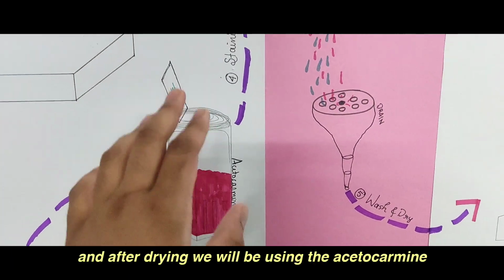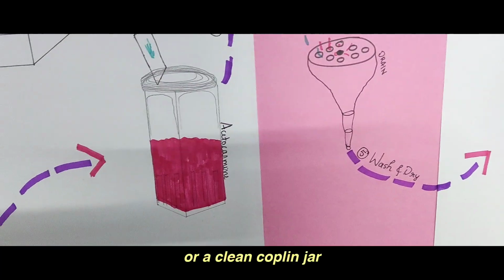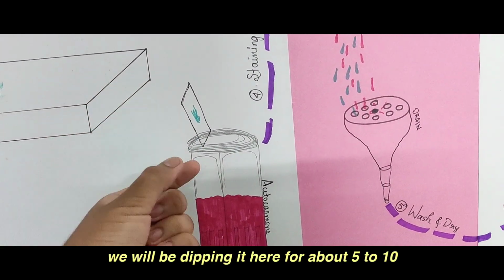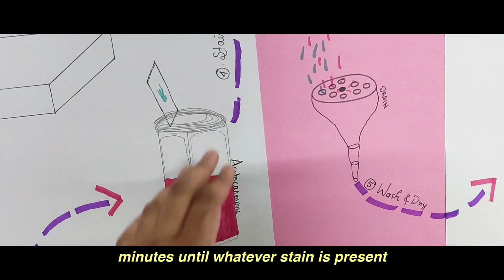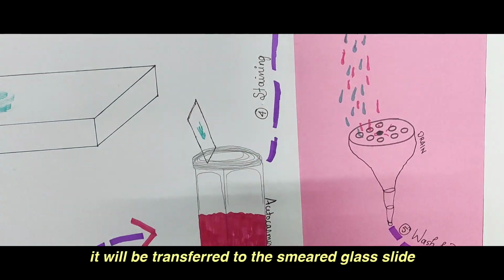After drying we will be using the acetocarmine in a new or clean Coplin jar, and the same dried slide we will be dipping here for about 5 to 10 minutes, until whatever stain is present is transferred to the smeared glass slide.